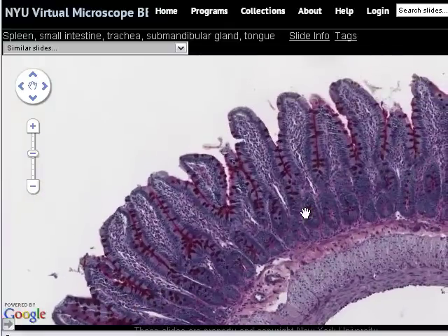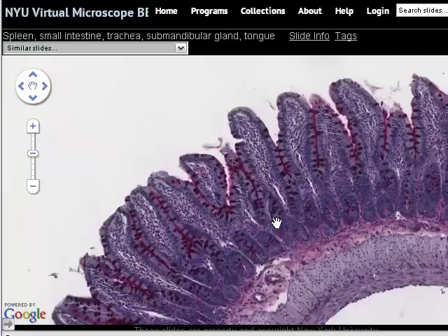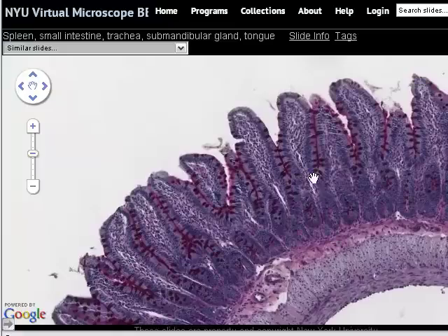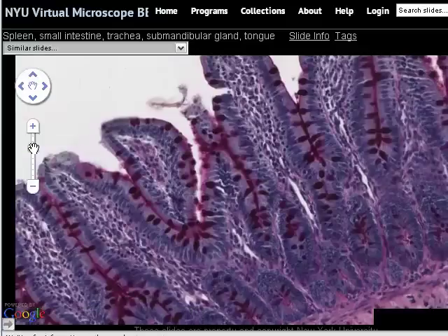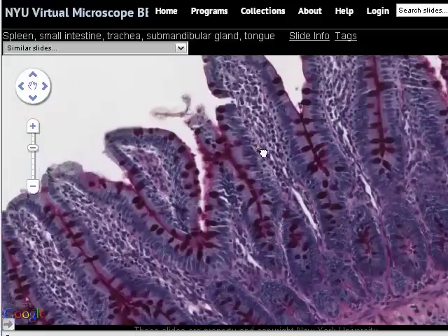The first thing you might notice as you look is that these finger-like extensions are rather close together, which we can see quite clearly. The second thing you may notice, as a distinction from prior hematoxylin and eosin slides you've looked at, is the presence of lots of very dense red staining structures here, which we'll look at in more detail in a moment.